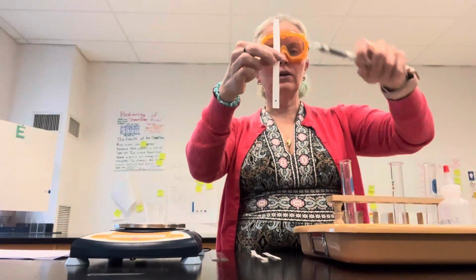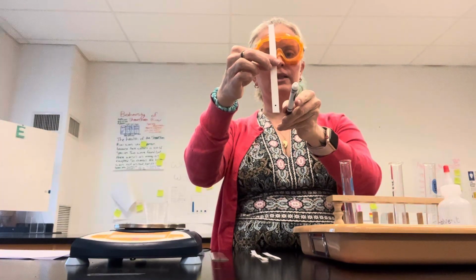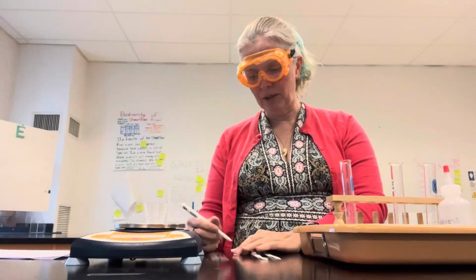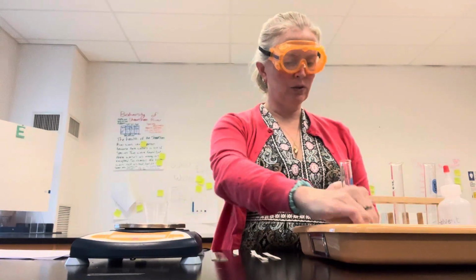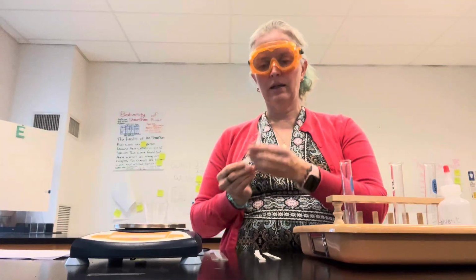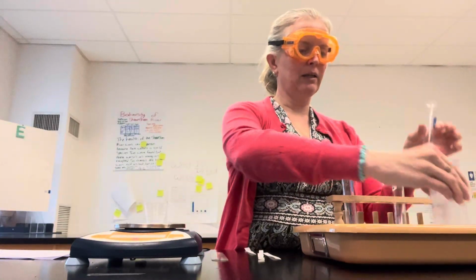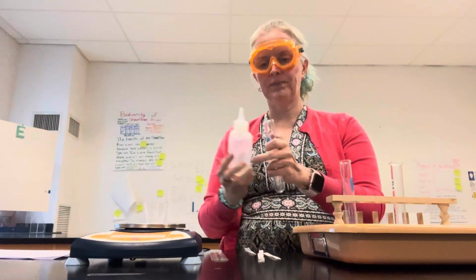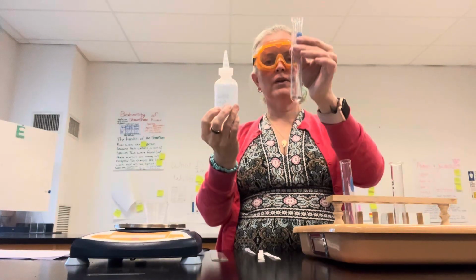And then I also want to make sure I know which marker was used for each one. You might put the marker next to the paper when it's being tested, or you might also put the initials of the marker at the top. I'm going to do that because the top of the paper shouldn't get wet, and so you should be able to see that letter afterwards. Then I'm going to add a little bit of my solvent to this test tube. That's why I'm wearing my safety glasses. You don't need very much.